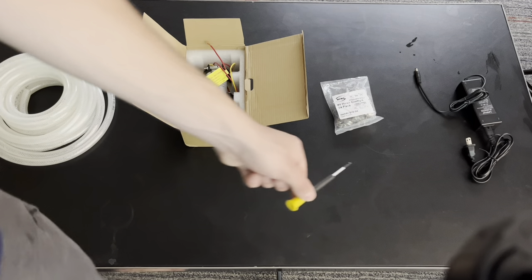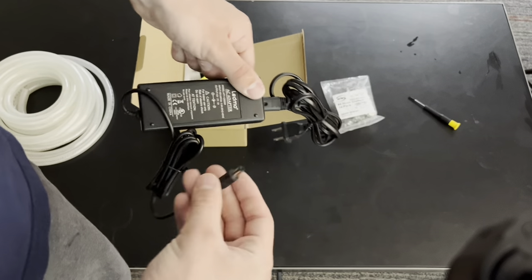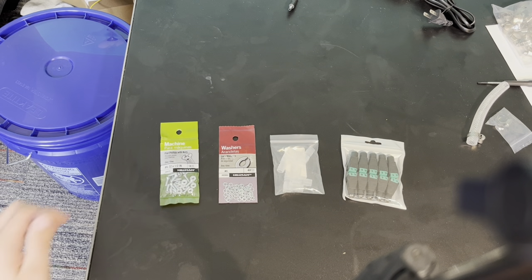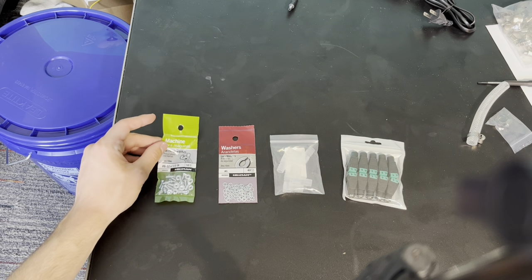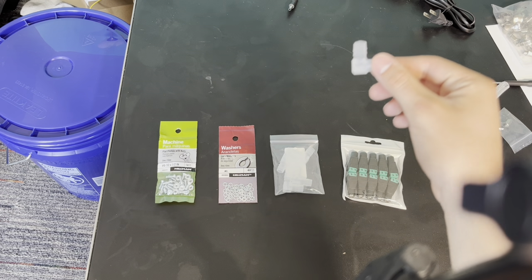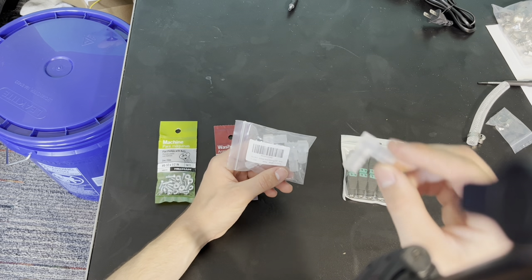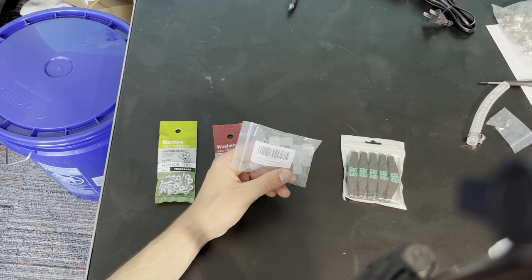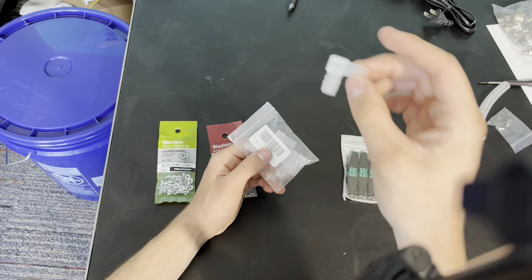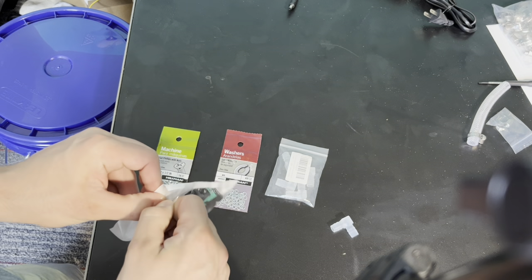You're going to tighten the hose clamps down with a standard screwdriver. To power the pump, you're going to need a standard AC to DC converter — the type of thing used to power computers, and pretty easy to come by. You'll also need some nuts and bolts to fasten your diaphragm pump to the lid of the container that will hold your water. These neck joints will help the tubing be a little bit easier to work with, and while not entirely necessary, I would highly recommend them because they're quite cheap and work well. To connect your pump to the DC power source, you're going to use female 12-volt DC power jack adapter connectors. You just loosen the screws on top and put the cables into them — pretty straightforward.